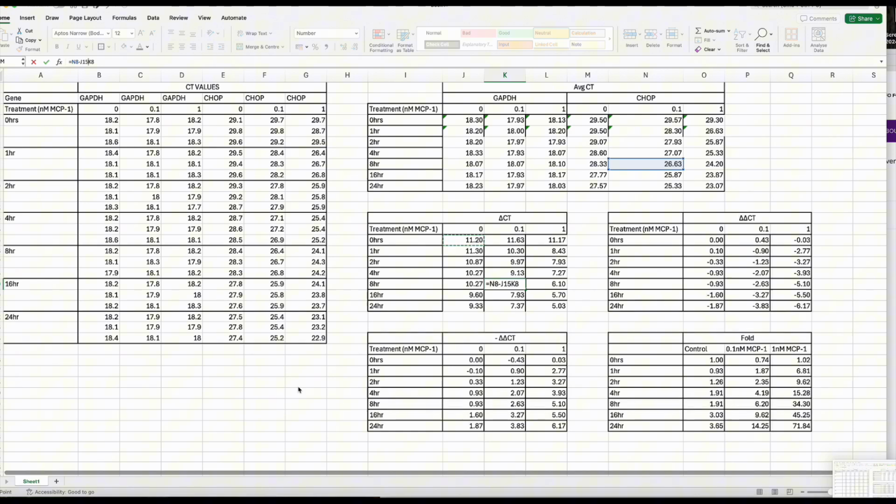So I'm actually going to highlight that box, so we can put that box right here, and that's going to be our reference gene, which means in the formula right here, if you look carefully, if I click on that spot, we're saying that this box is subtracting from its own box. Okay, so that should give a value of 0.